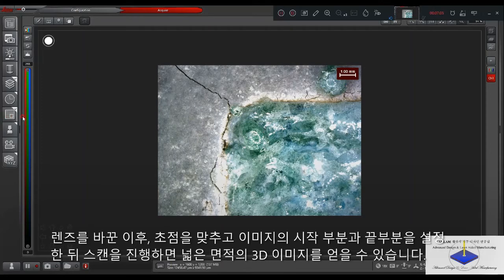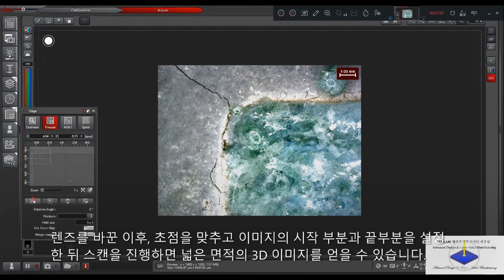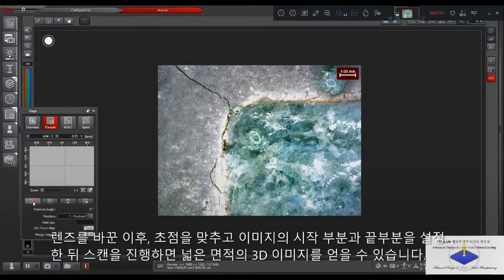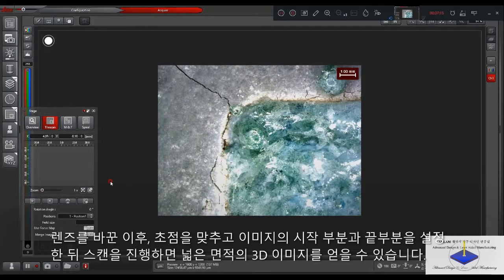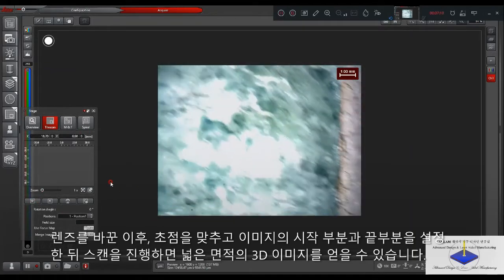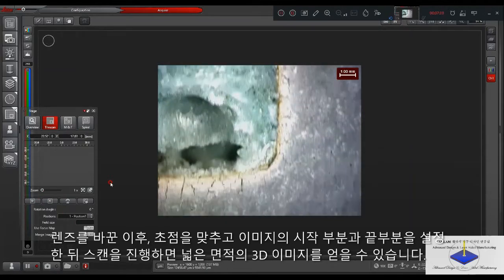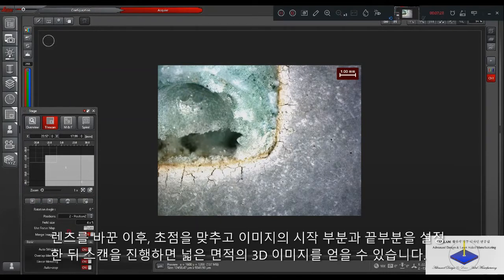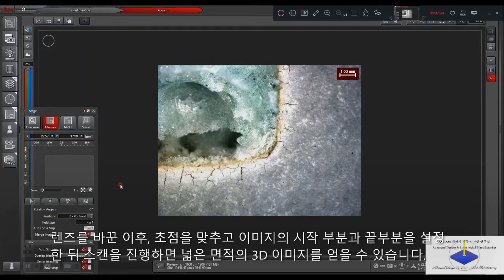Okay, in the first part we only used the z-stack, but to get a much clearer image of our 3D, it is better to use both functions. So using this function, I don't know what it's called, then you move the sample to this other edge. After observing the first edge, we also move our sample to the other edge.